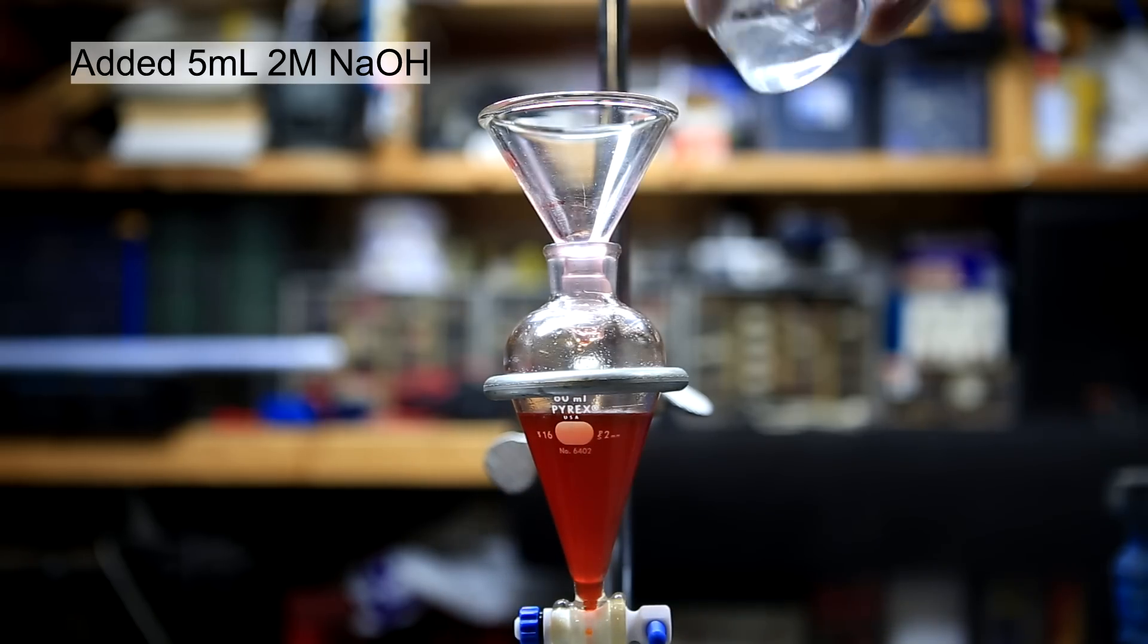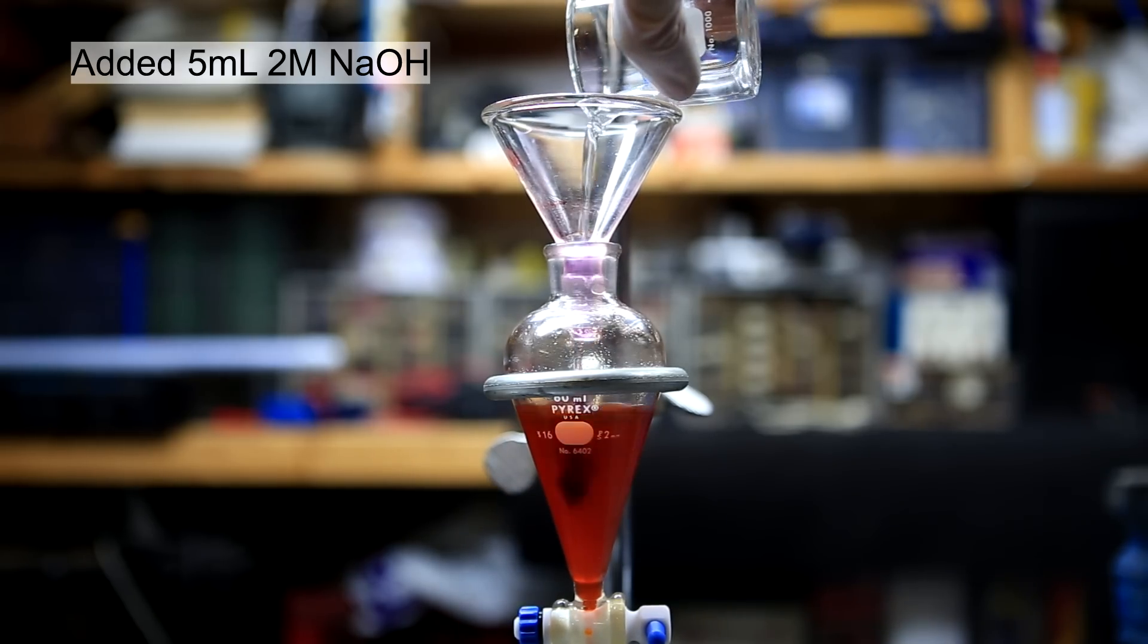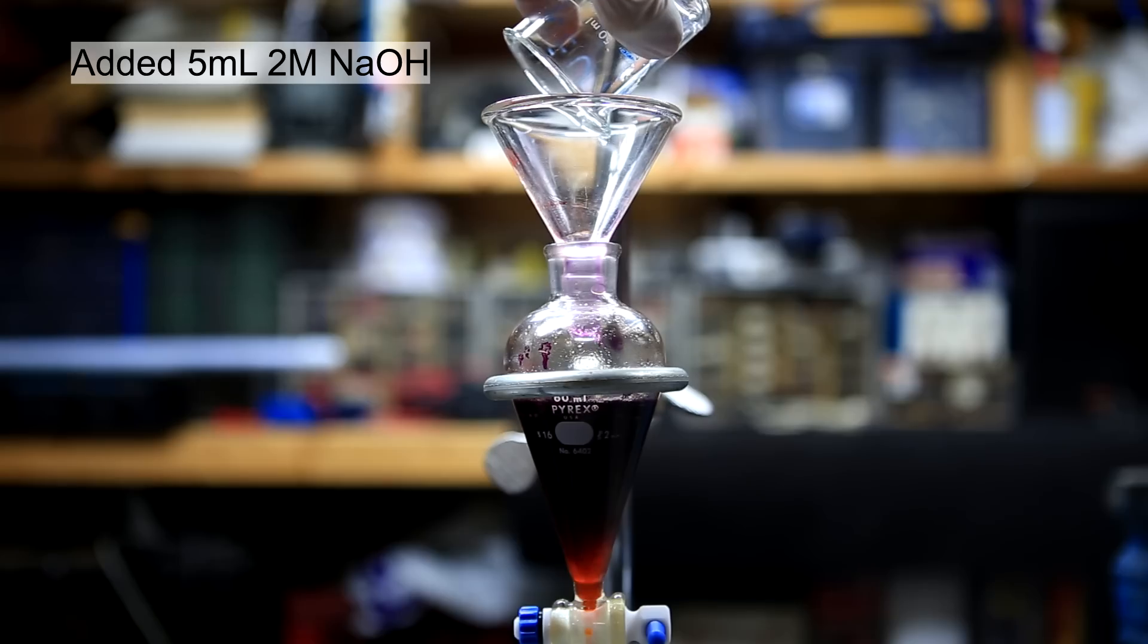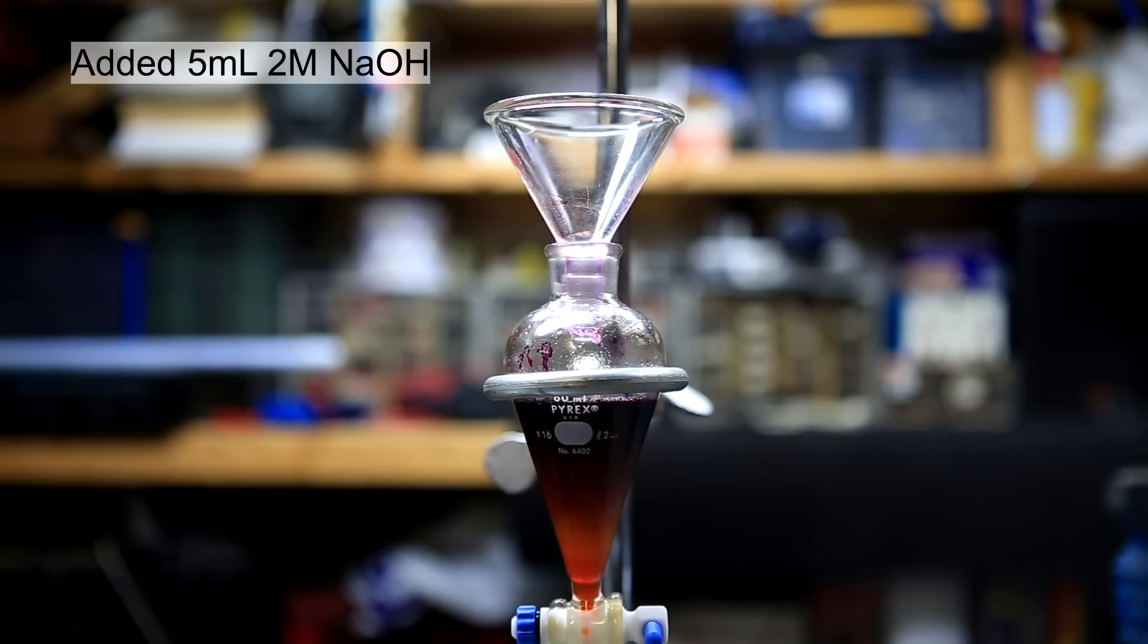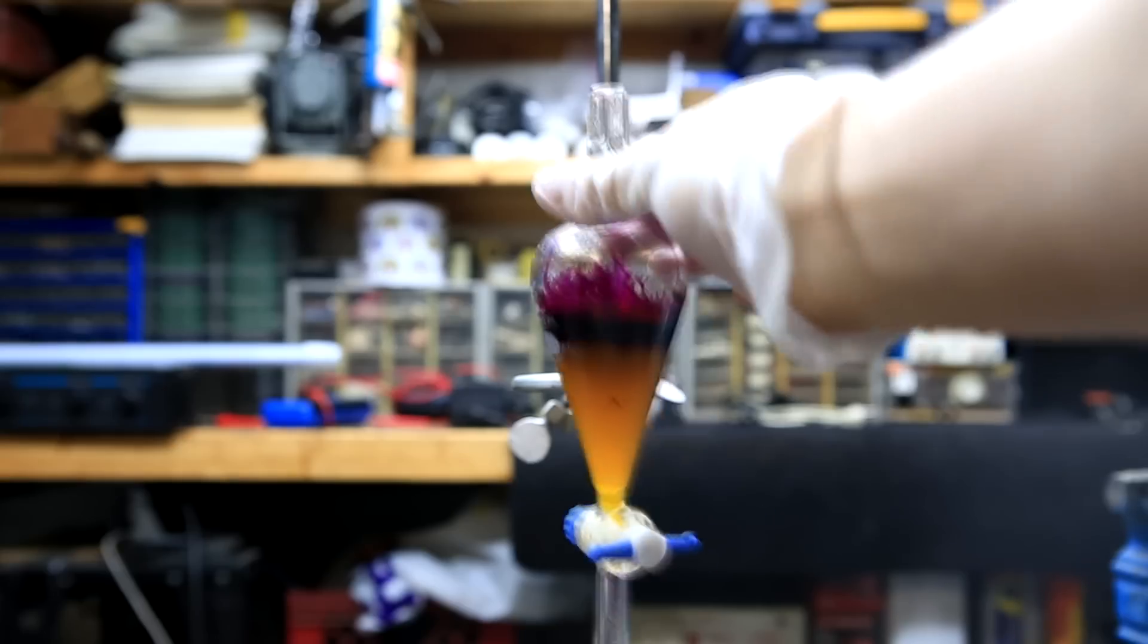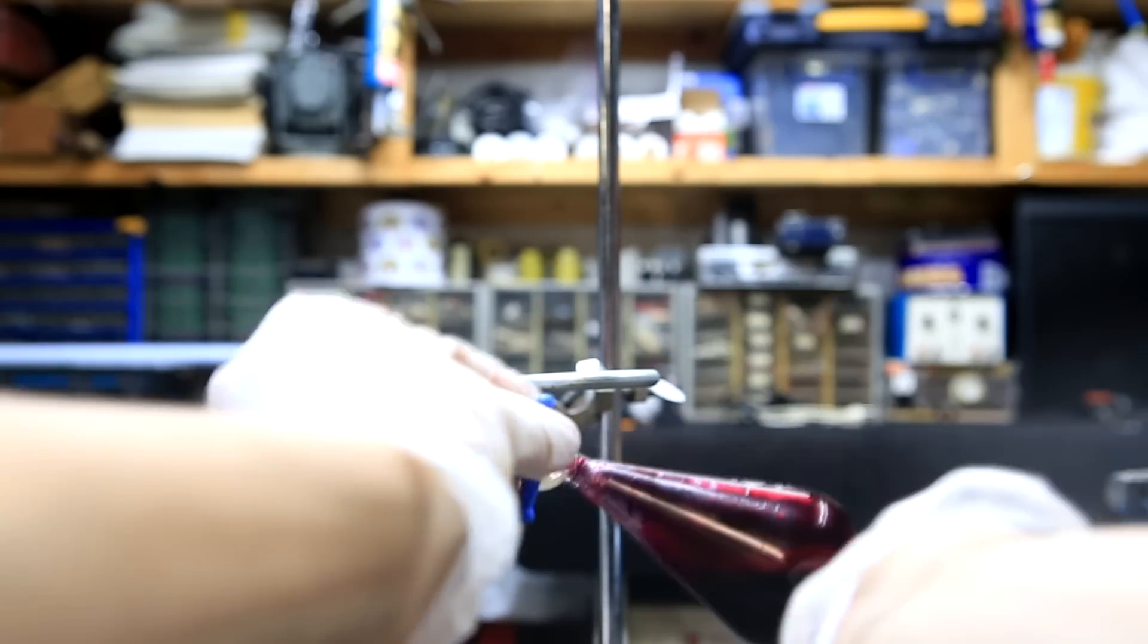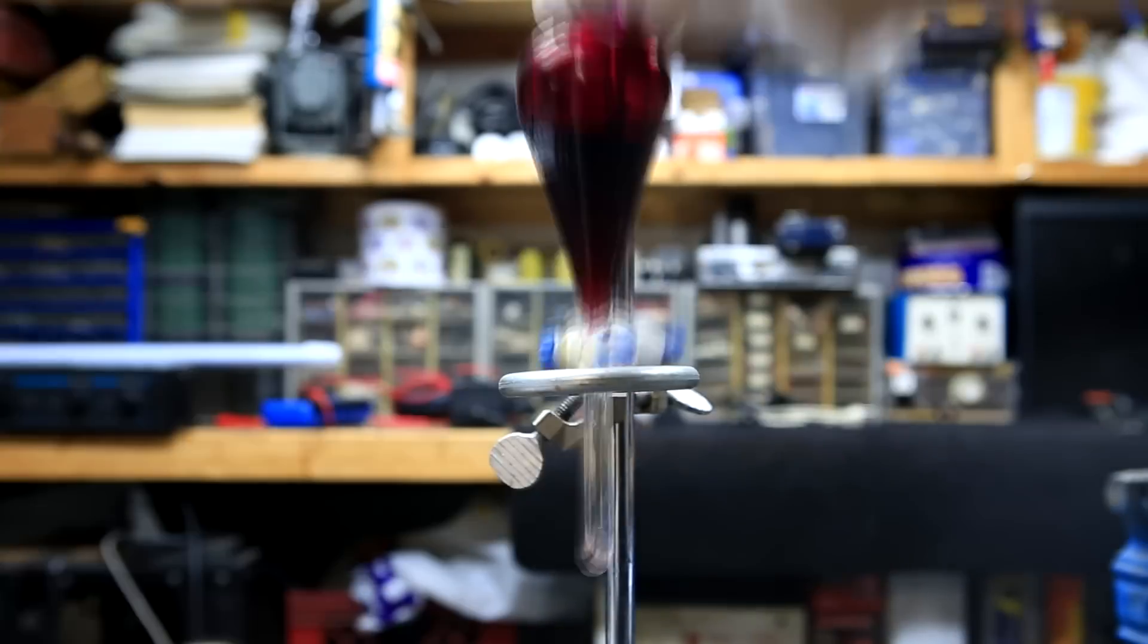To this was added 5 ml of 2 molar sodium hydroxide. In this step, we're converting phenolphthalein into a water-soluble salt which has its characteristic purple color. The separatory funnel is capped and shaken vigorously to make sure that we react as much of the phenolphthalein as possible.